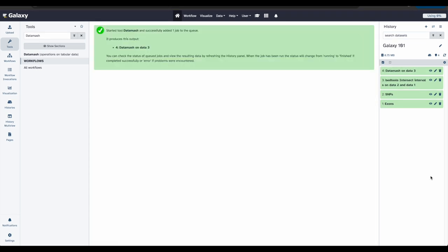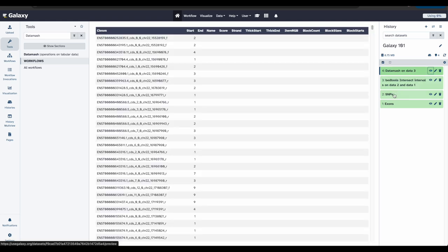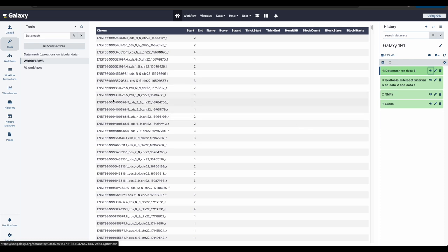Once the job has finished, click the eye icon again to view the results. Your new output data set should look something like this, with only two columns. The first containing the exon IDs, and the second showing how many snips were present in that exon.